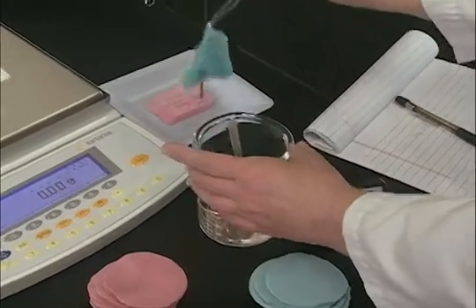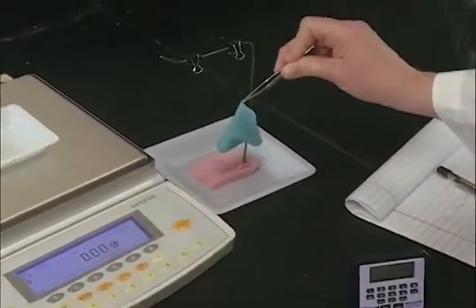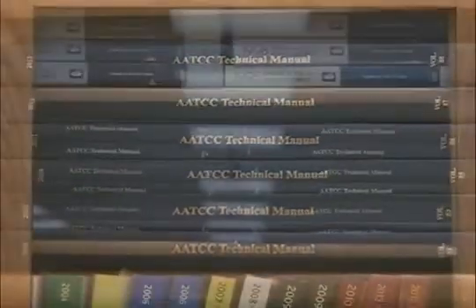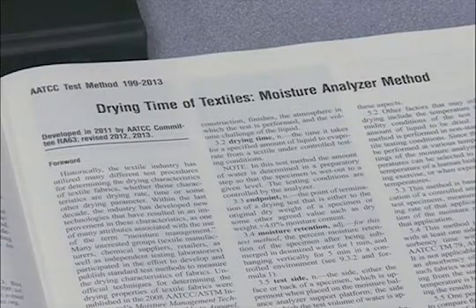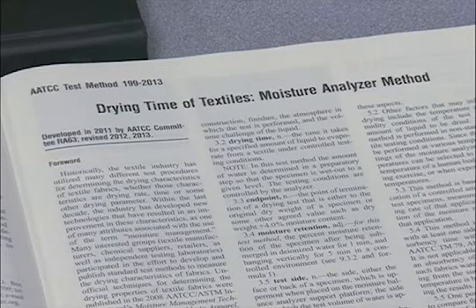The next test methods are those associated with the drying of water from fabrics. AATCC Test Method 199, Drying Time of Textiles, Moisture Analyzer Method, is intended to evaluate the drying time of fabrics using a gravimetric moisture analyzer equipped with a heating element.